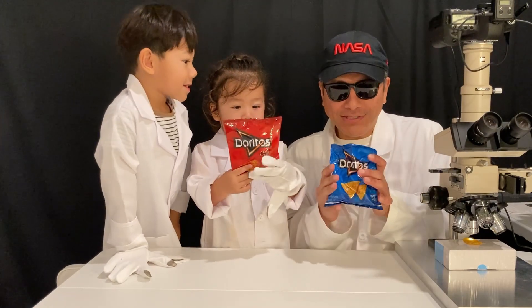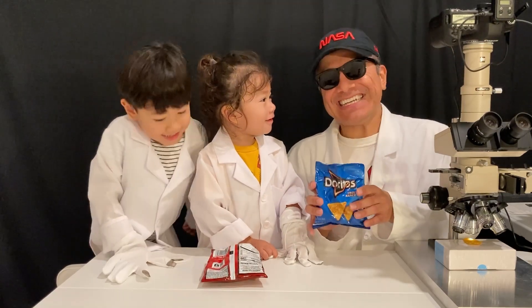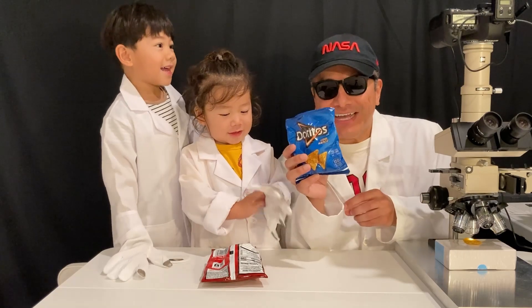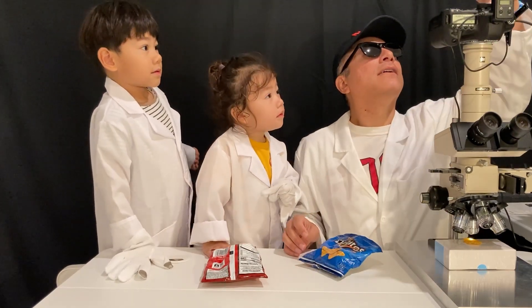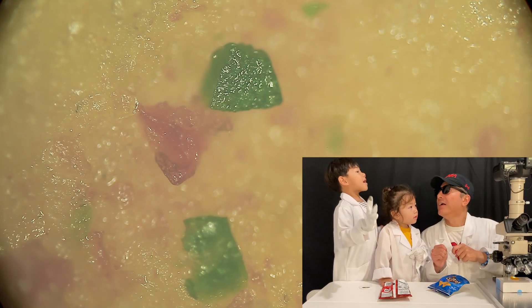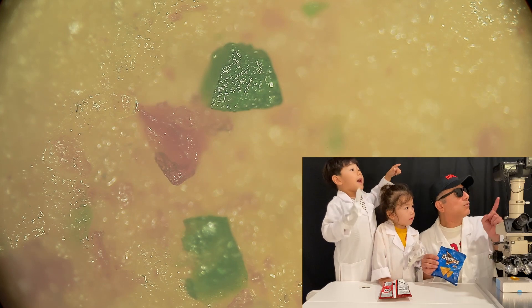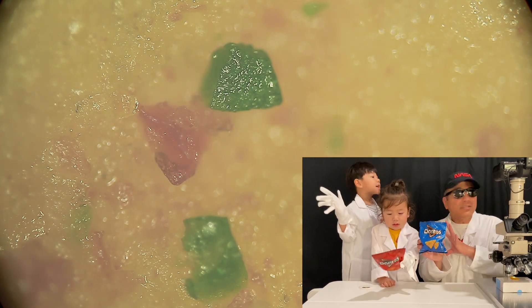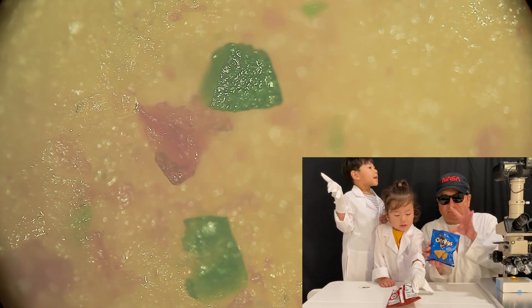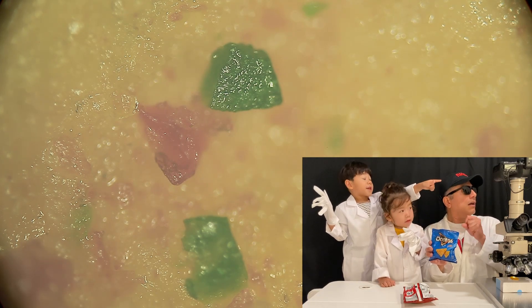So let's take a look. I've got one of these ready under the microscope. Let's take a look and see what it looks like. There it is. I can see a little bit of green right there. Yeah, it has green and red. And pink — reddish pink. These Cool Ranch chips are sprinkled with... and I see a lot of yellow and gold.